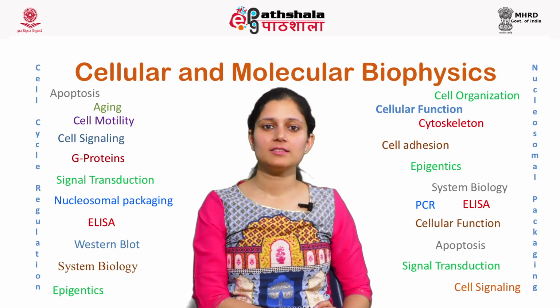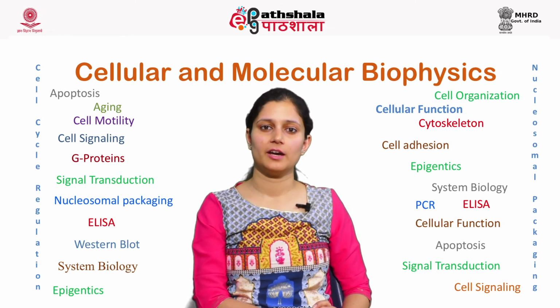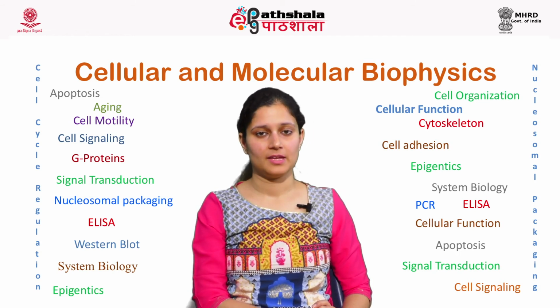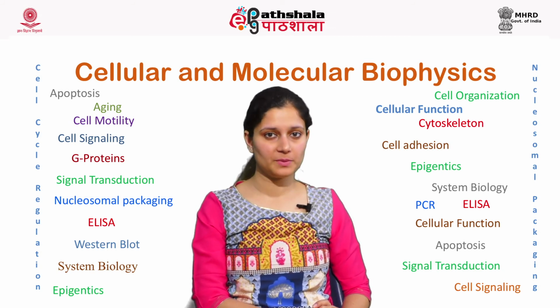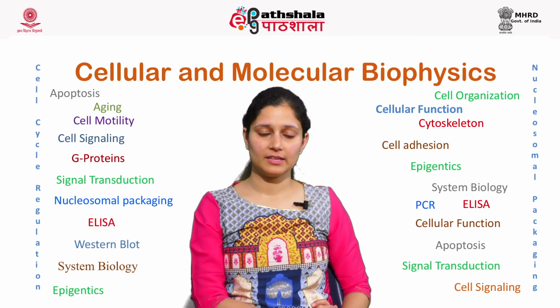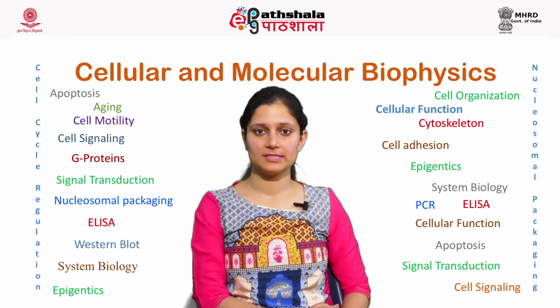Conventional PCR is an end-point assay. However, real-time PCR measures the PCR product formed in real time. That is, measurement is done after each cycle of the PCR. In real-time PCR, the amount of DNA produced after each cycle can be quantitated using a double-stranded DNA dye which binds only to double-stranded DNA.